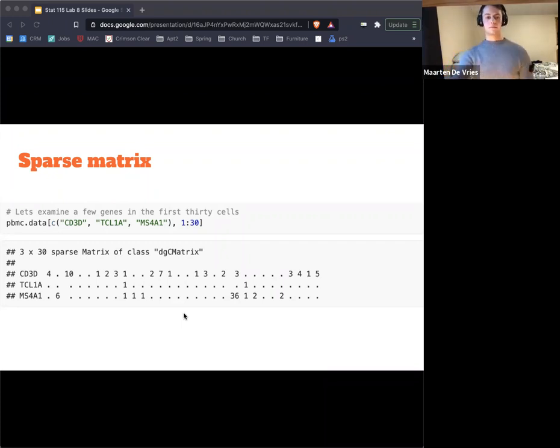One thing to know, this may not be relevant for the homework, but if you go and use Seurat later on, if you try to use some packages written in R, those can, under the hood, convert a sparse matrix into a dense matrix by calling as.matrix or something. You have to be careful because that can quickly blow up. A dense matrix may be 30 times as big in size, and the sparse matrices are already big. They can already be gigabytes. So then you might have the forever spinning wheel, and it may take forever. So you have to be a little careful when using outside functions and saving matrices.